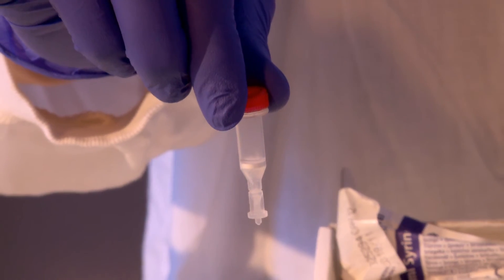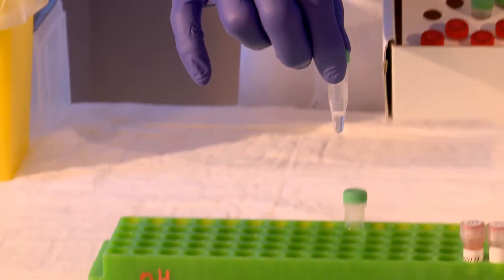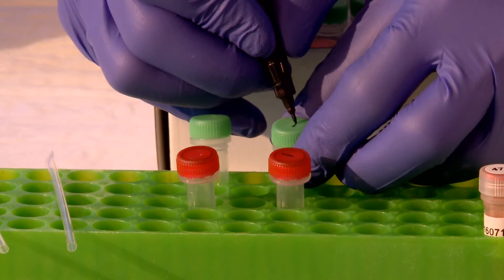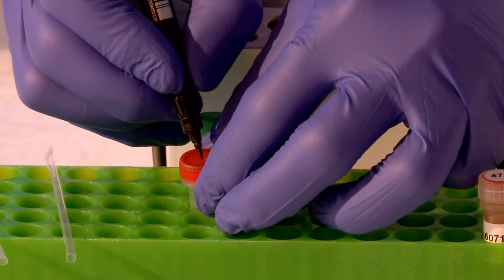Remove one red-capped column and one green-capped vial for each sample to be prepared. Label both the red and green lids clearly with the sample name.